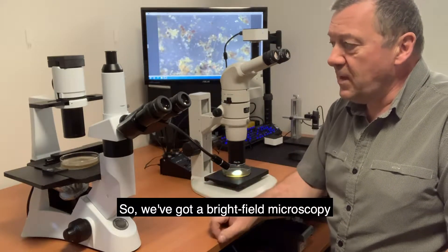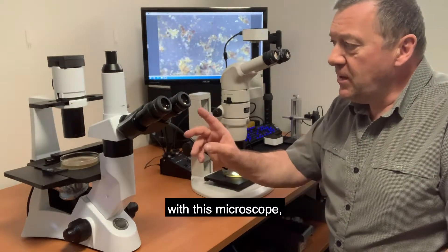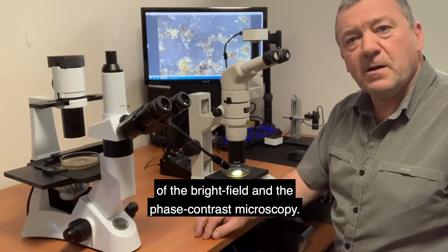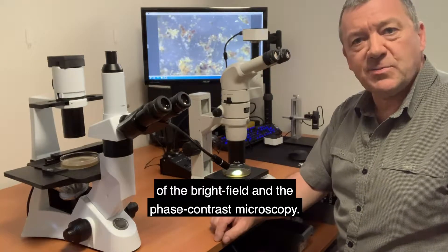We've got brightfield microscopy on this microscope and we've also got phase contrast. We'll be showing some videos later on in the clip of the brightfield and the phase contrast microscopy.